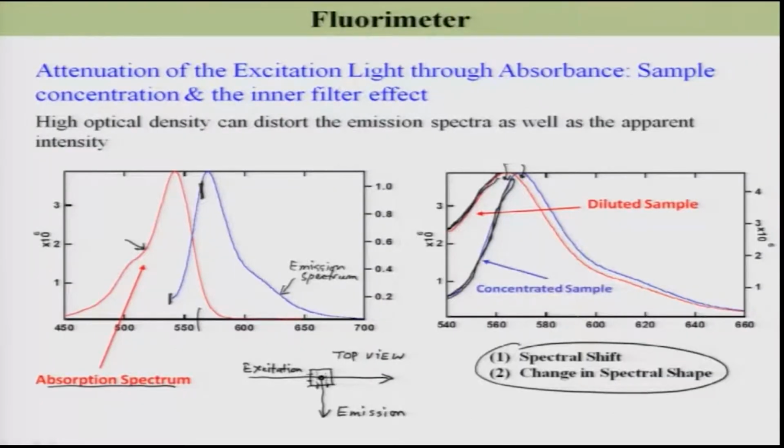So, we need to be cautious while measuring this emission spectra. So, measurement of emission spectrum is not trivial, it is difficult, I can tell you. It is not like absorbance. Absorbance is fine because it is just a ratio I0 by I, take a log, plot it versus wavelength, but in this case it is not like that. So, you need to really take care of different aspects, right.